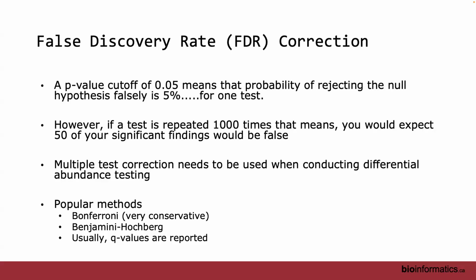I'm not going to go into more detail than that. Just keep that in mind. You should usually be applying an FDR cutoff. Sometimes that's built into the DA method that you're using already, but it's good to figure that out.